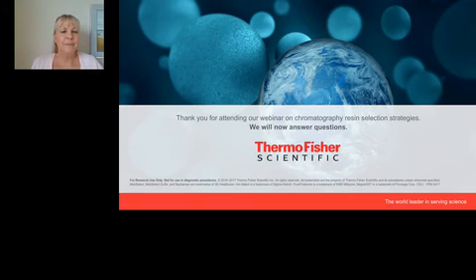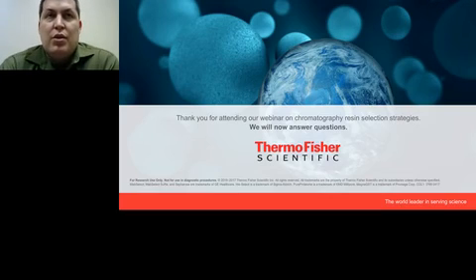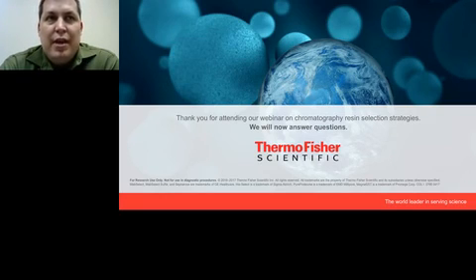Great, thank you. The next question is for Aaron. You've talked about using Poros in packed chromatography columns for an LC. Can Poros be used in gravity flow or spin column? Thanks for that question. So really, they can be used in spin columns. You just don't get all the benefits that go along with the porous chromatography resins. Gravity flow, however, they significantly slow down the flow rates due to their bead structure and the small particle size. So it's really not recommended for gravity chromatography.